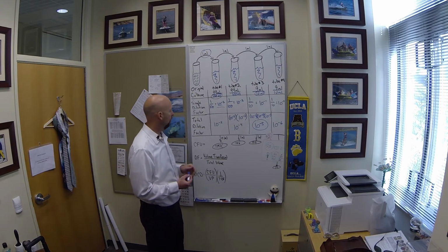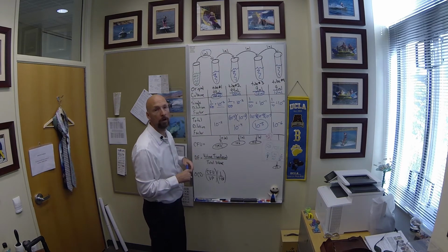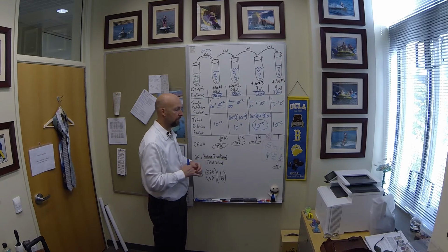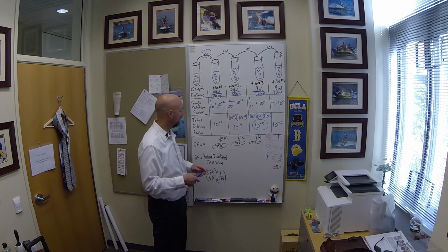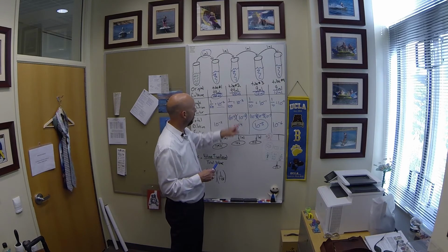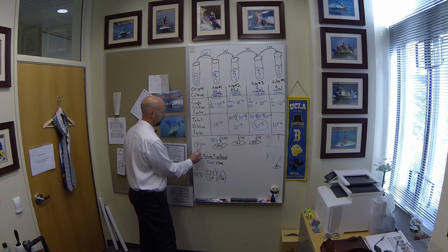Now we need to determine, well, let's say we plate a particular volume from each tube. So from tube number 1, we're going to plate 0.1 mils and then incubate it and count the colonies. After we plate 0.1 mils and incubate the plate, there are too many colonies to count, right? If it's more than 300, you can just say too many to count, or sometimes you might see TNTC for too numerous to count. Means the same thing, too many, okay? In tube number 2, we plate 1 mil and get 756 colonies, or 756 CFUs. Remember, these are in CFUs, colony forming units.